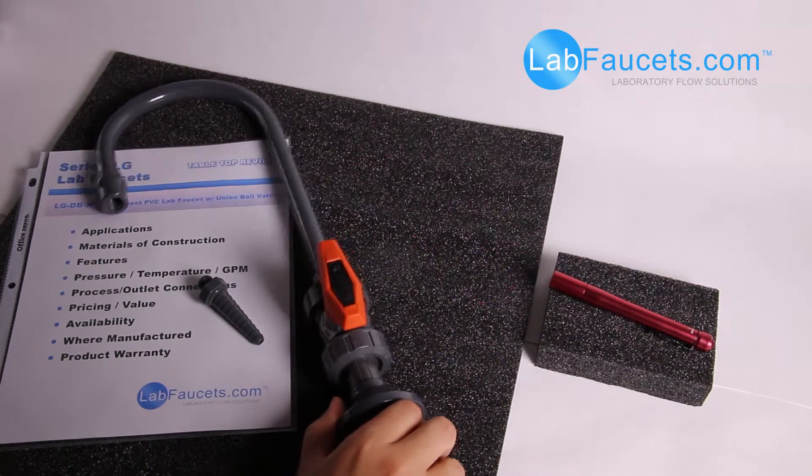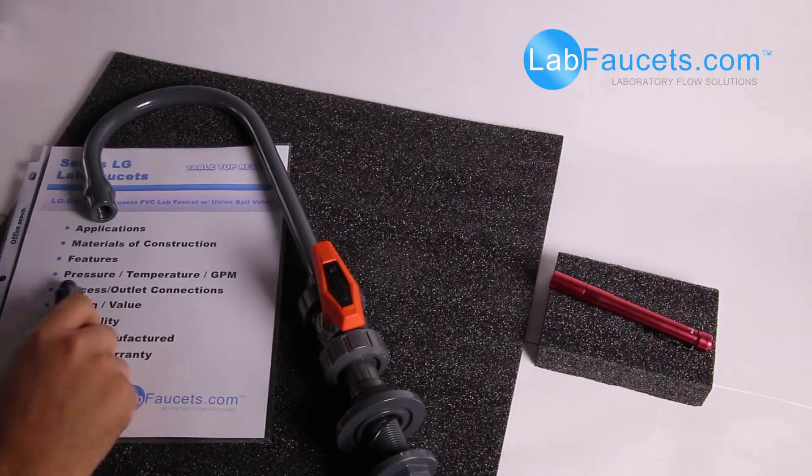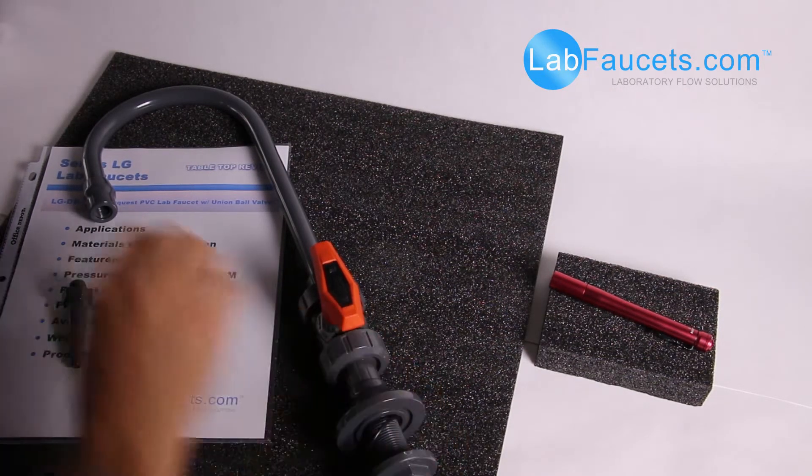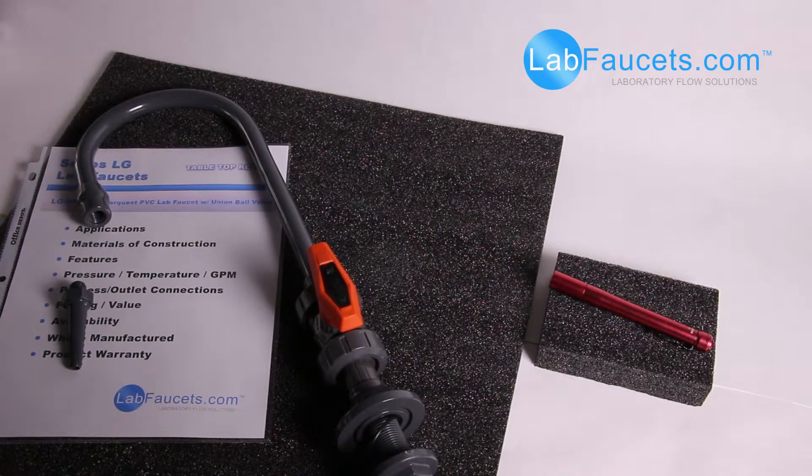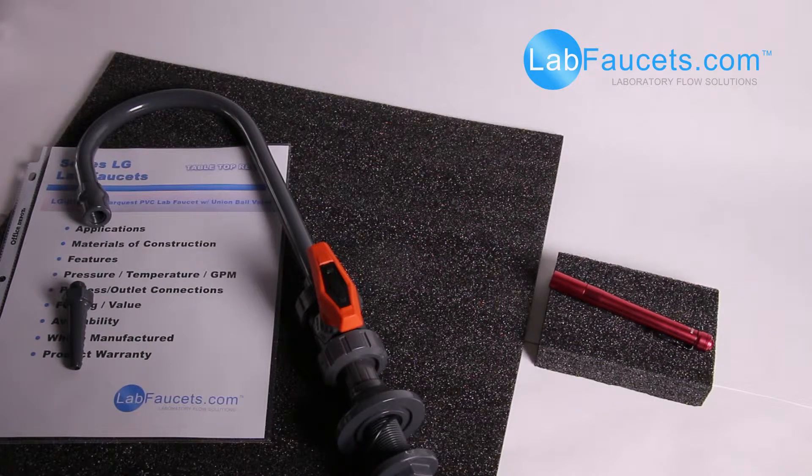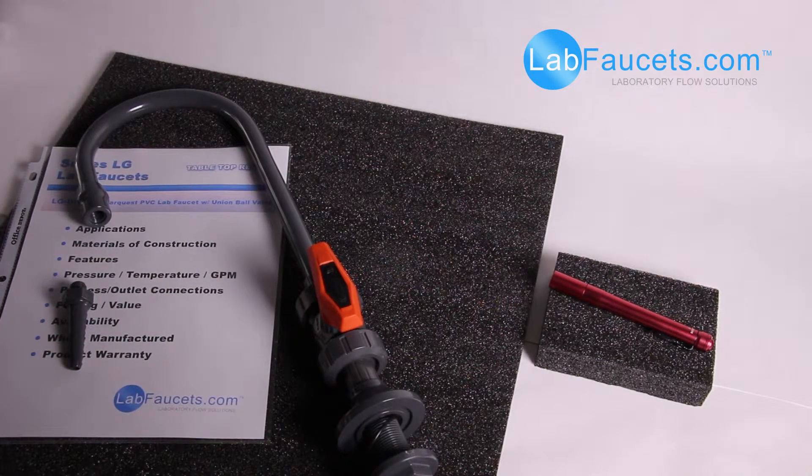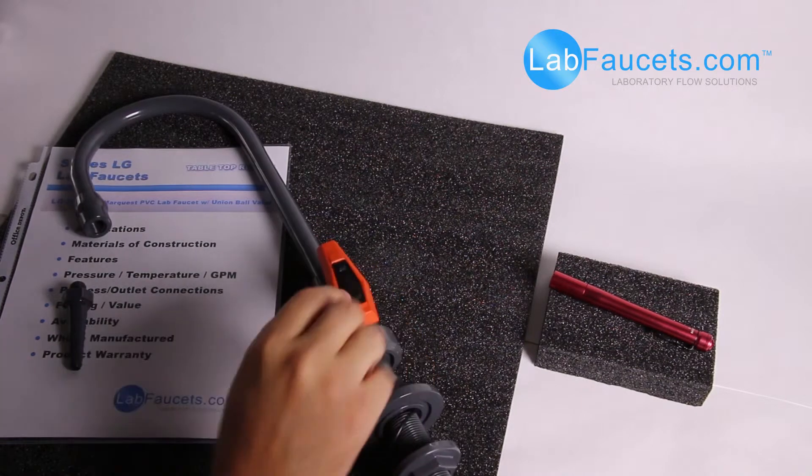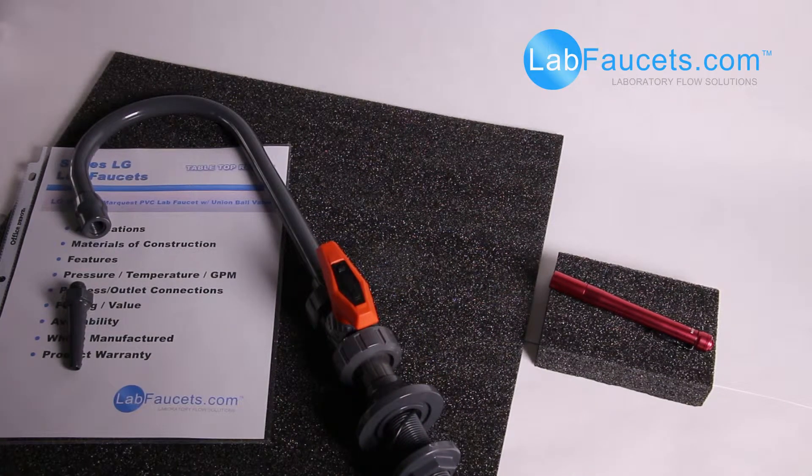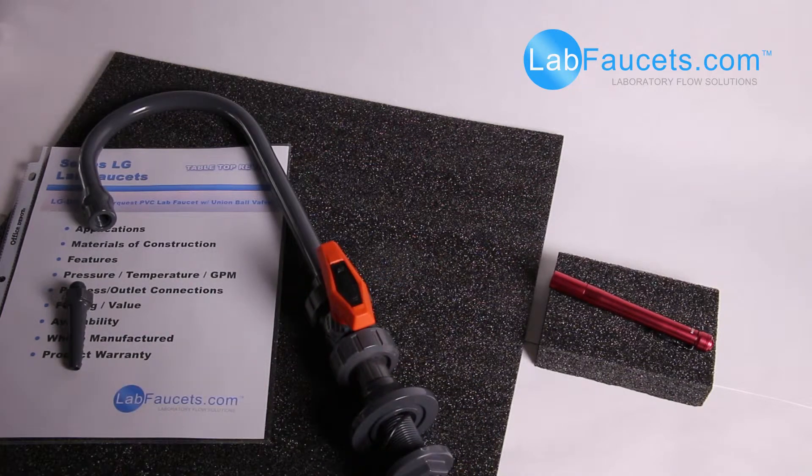This unit is manufactured primarily in the United States. These fittings, the gooseneck, the lab base here, the through-deck nipple shank is all manufactured in Costa Mesa, California. This valve is actually manufactured in Schaffhausen, Switzerland. Hence, finding a high-quality unit where you're able to install and not have to worry about the long-term issues of a failing handle or valve have been addressed.